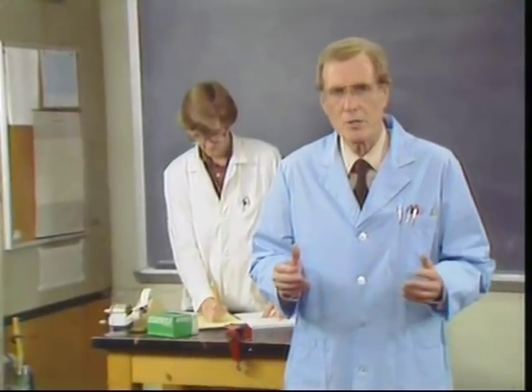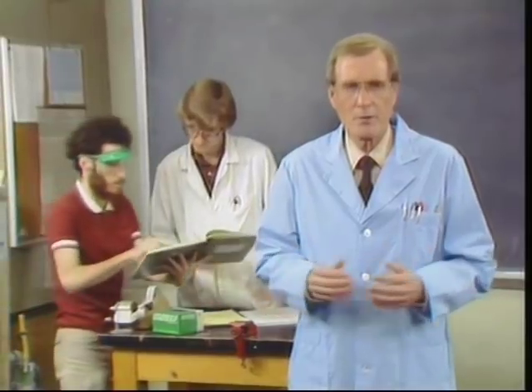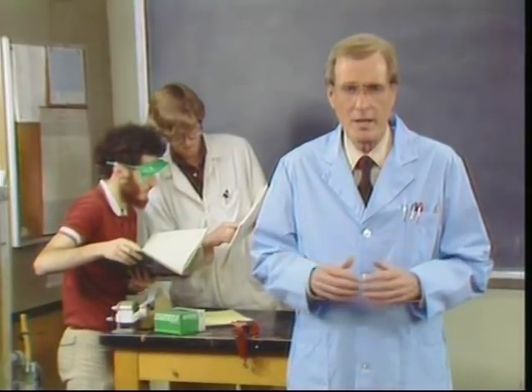As we've said earlier, always report all accidents to your instructor. This means reporting all fires, even the little ones. Your lab instructor is there to help you, and if you are ever in doubt about any chemical experimental procedure, or if your experiment seems to be doing something unexpected, talk with your lab instructor. Never assume anything when it comes to your safety. And if you need help, yell.